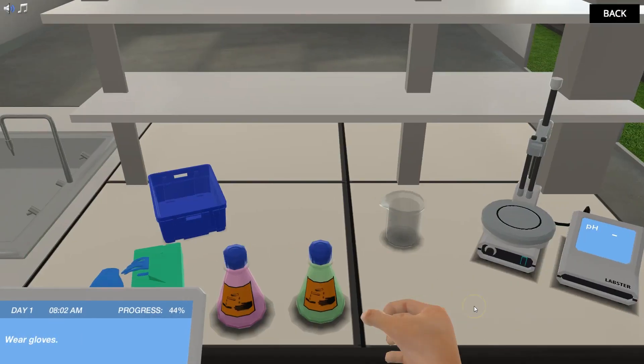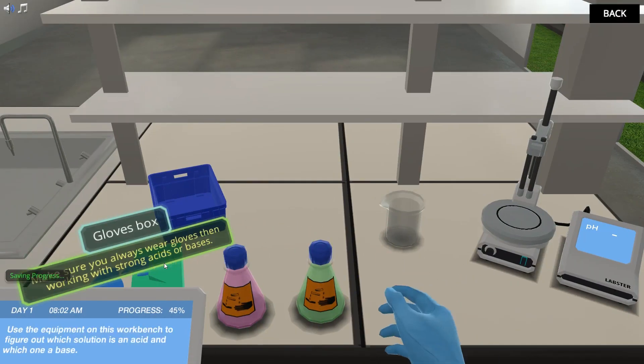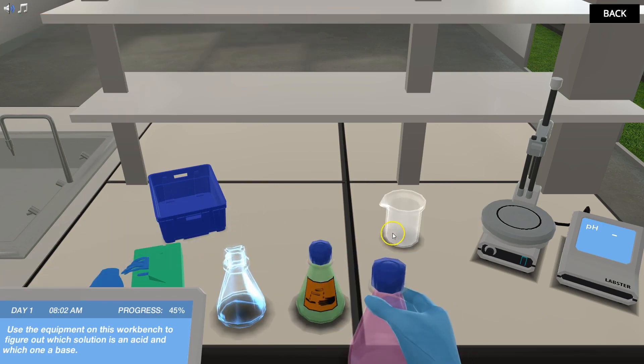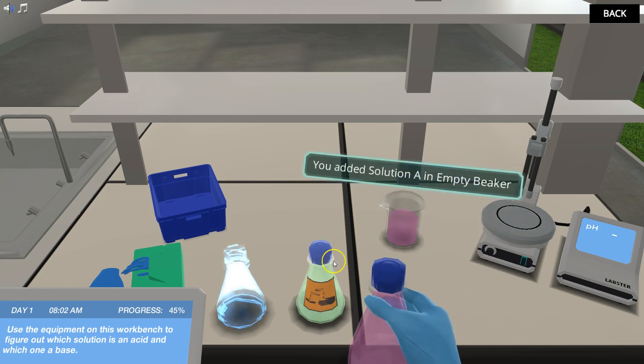In the acids and bases simulation, you get to learn the basics behind acidity, one of the most important physicochemical properties of molecules and how it influences the world around you.